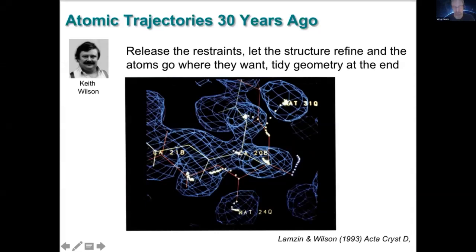Molecular replacement was pretty far away. You can probably see it in red color. And unrestrained refinement moved atoms quite far, and you see the trajectories. Some atoms migrated far away, had to be removed or became waters. Some migrated to the positions of other atoms. Some extra atoms had to be probably added because there was nothing. And that was, I think, the foundation.